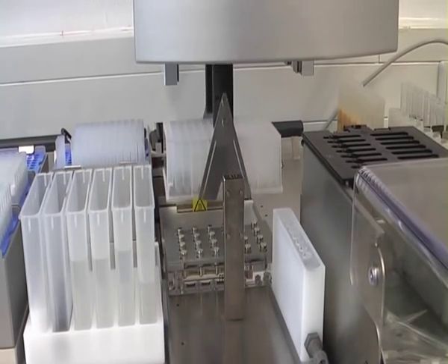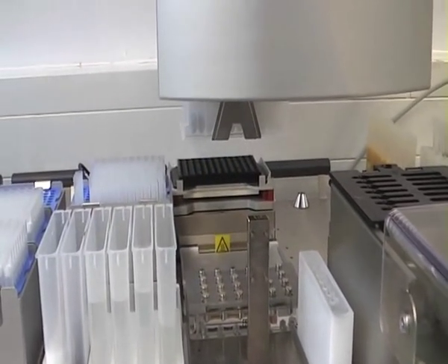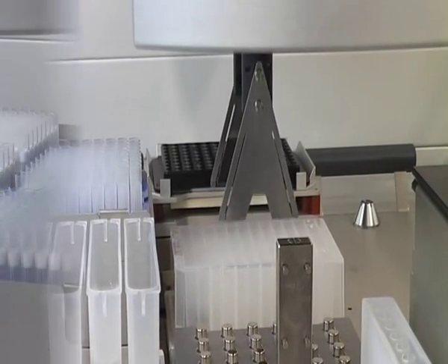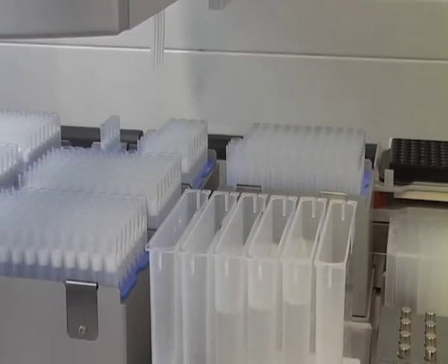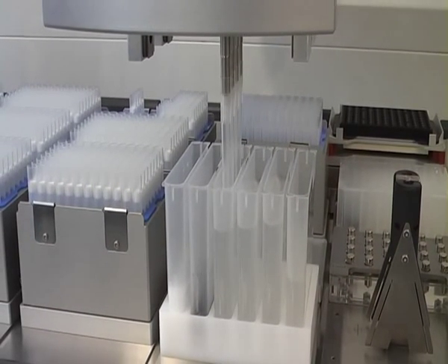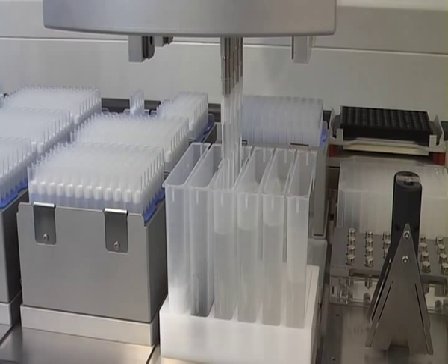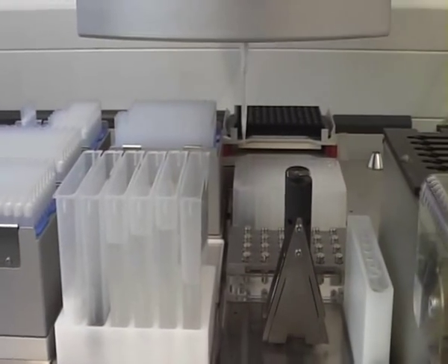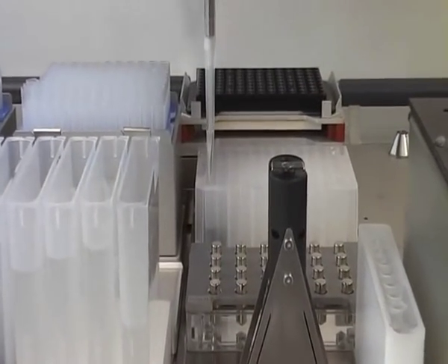In order to remove residual impurities that may have remained in the pellets and further purify the DNA, the process plate is transferred back to the work position, where Wash Buffer 1 is added. After resuspension of the pellet, a second magnetic separation step follows. A total of 3 consecutive washing and separation steps are carried out, with Wash Buffers 1, 2, and 3.